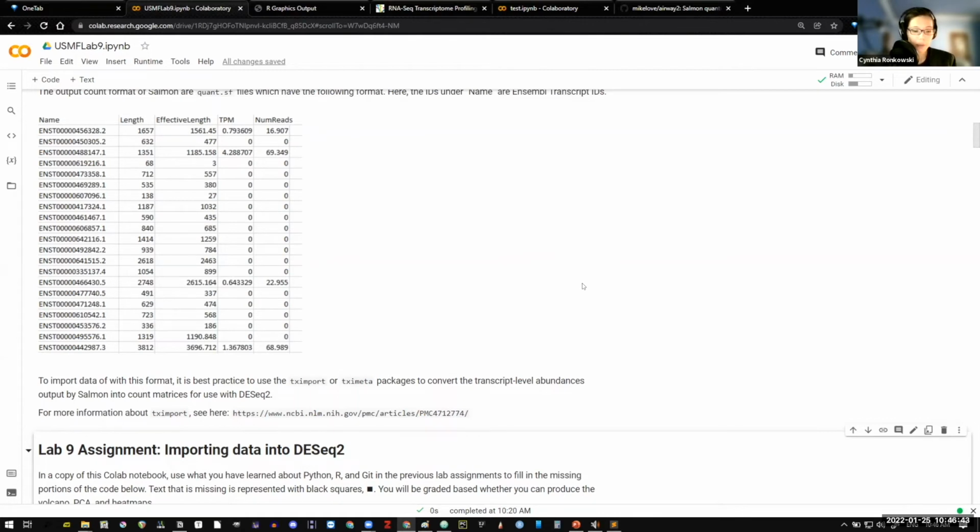Sometimes for technical reasons, one of the runs gets lots and lots of reads, and one of the other runs doesn't get that many reads. They're still from the same sample, so relative amounts of gene expression between those samples should be the same. However, the absolute number of reads would be different simply because more sequencing was done on one of the runs.